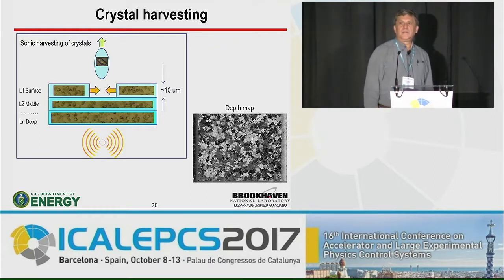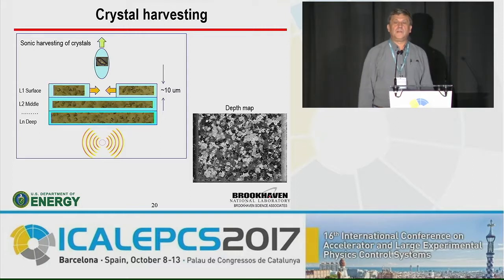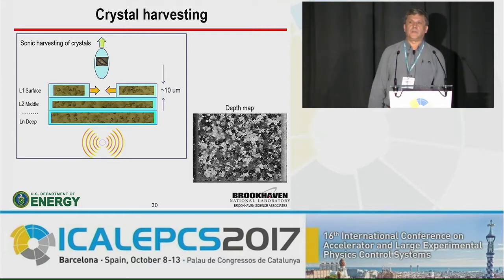Probably I missed it. Did you use some photogrammetry technique in order to get depth images? No, we've used only that microscope, nothing else. Stacking? Yes. In terms of distance? We know, because we are moving the sample, how many microns it's moving. So we have the calibration of the specific position of each image and where the crystal, for example, is.